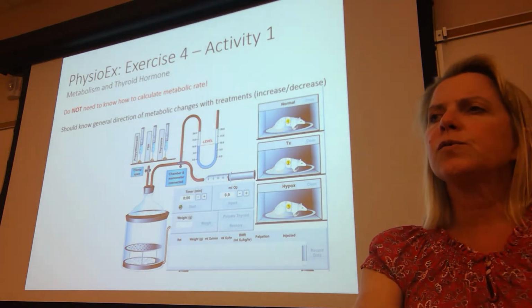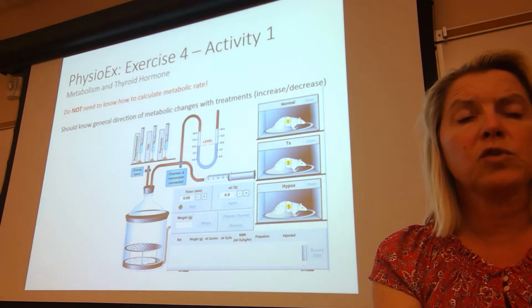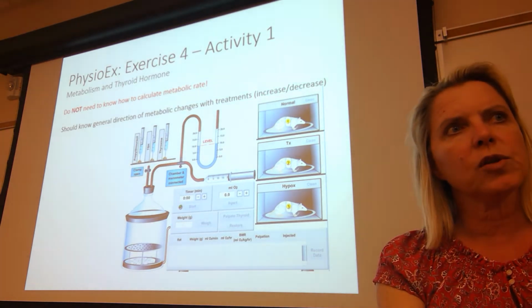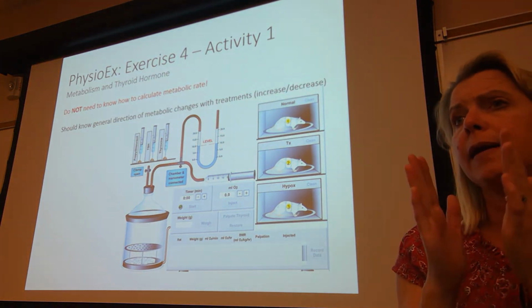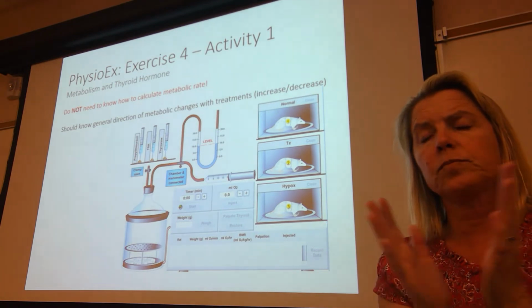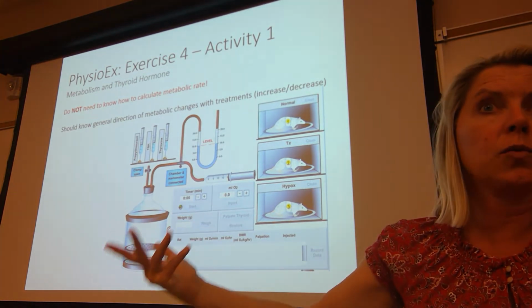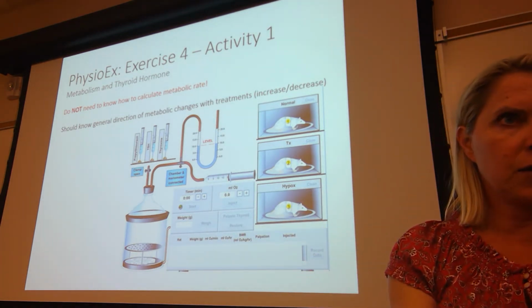And in some of these rats, when we injected TSH, we found a goiter, which means an enlarged thyroid gland, which can enlarge either from hypertrophy, which means the cells that you already had got bigger, or hyperplasia, which means more mitotic rate. When we have a goiter, both occurs.